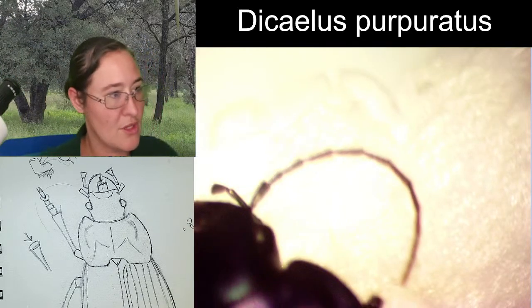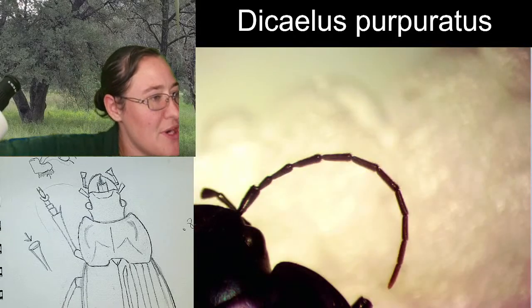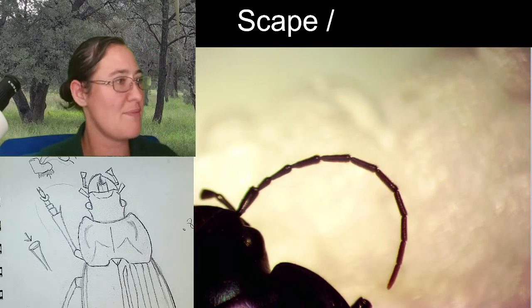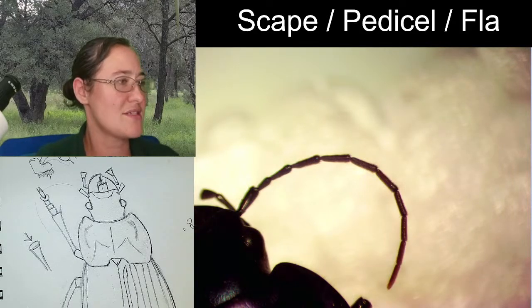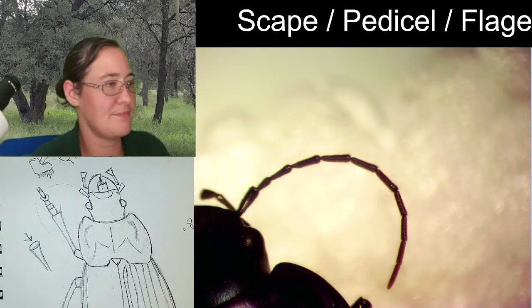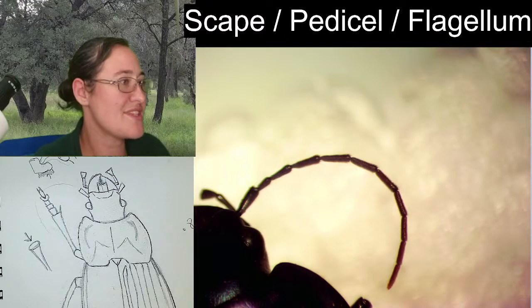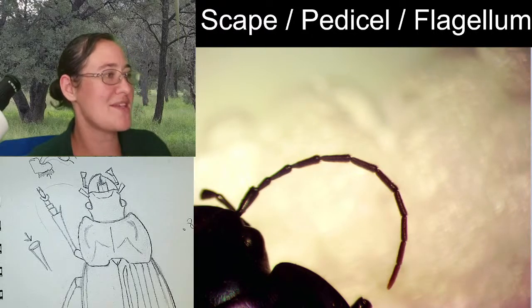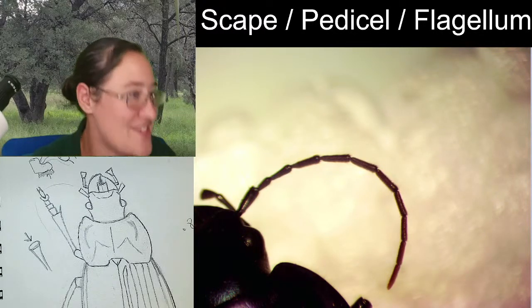Just so that you have the words for your paper, you have the scape, the pedicel, and the flagellum. The scape is the first segment, the pedicel is the second segment, and the flagellum are all of the rest of the segments.